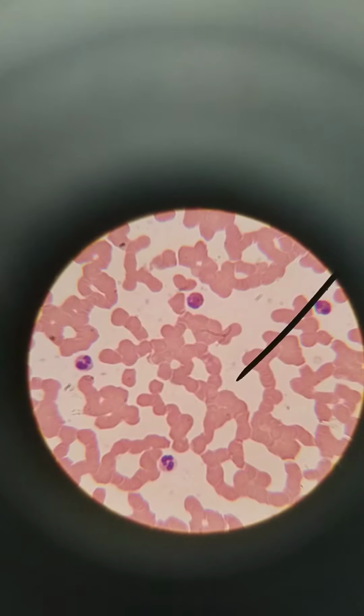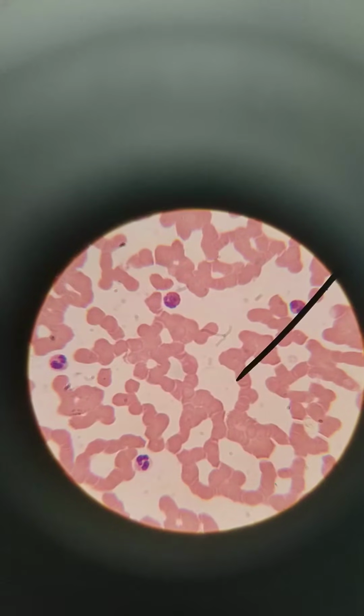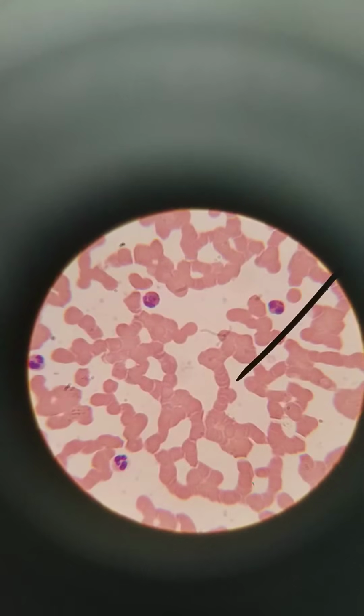Hey y'all, we're taking a look at some histology of slides with blood disorders. So this slide, right now I'm at 1000x, so I'm at a really, really high magnification, the oil immersion lens. What we can see, of course, are a bunch of erythrocytes. You can see how they're kind of stacking with each other. That itself is not indication of a problem. That just happens sometimes when you prepare a slide.